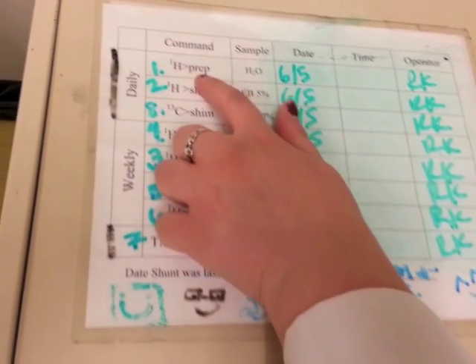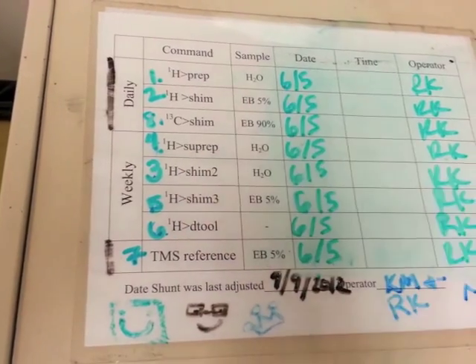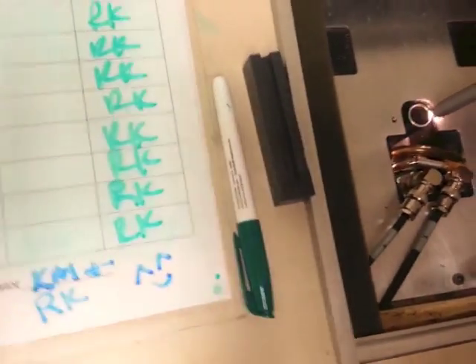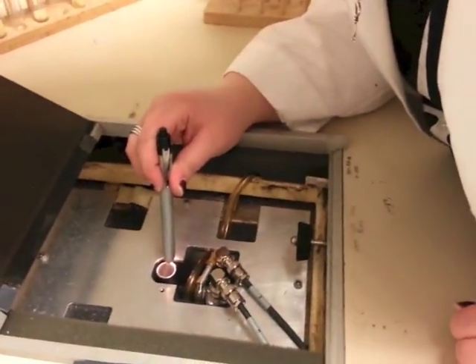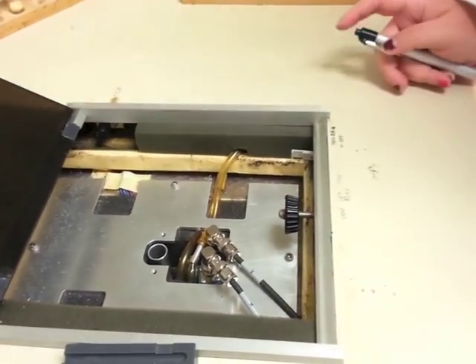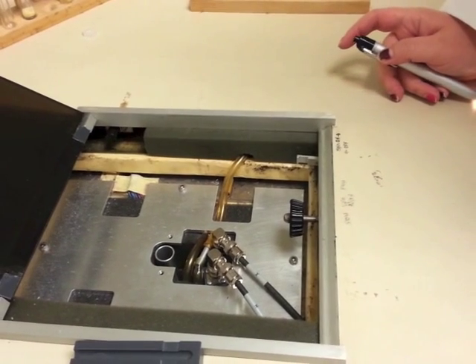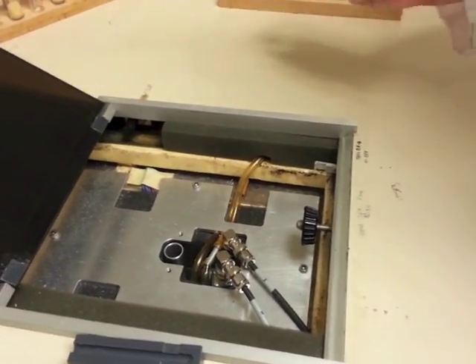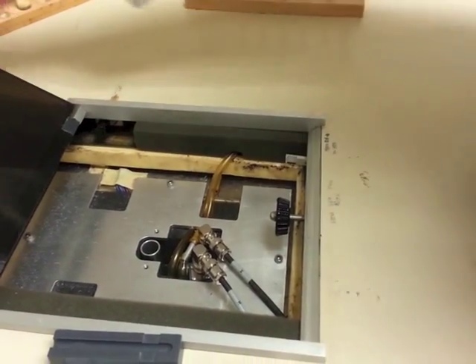The first command is PREP, so for that we need the water sample. That should already be in the machine, so you want to come over and open up the machine and use the pen light to check if the water sample is spinning. The way to tell is there's a little sharpie line on top of the bobbin. If you can see the sharpie line, it is not spinning. If you can't see the sharpie line, it is spinning. Once you make sure the sample is spinning, close the lid again and come over to the computer.